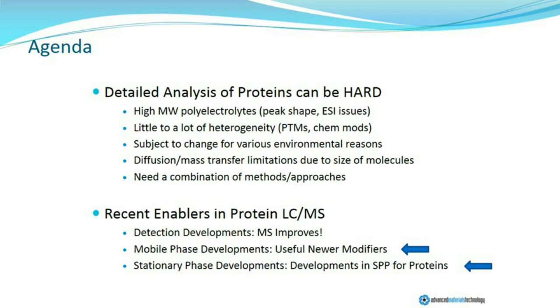Now, because of the inherent complexity of the analytes that we're interested in, I do not want to give you the impression that there is a singular technique or technical approach to resolve the analytical challenges for protein or peptide analyses. So we're generally talking about a combination of methods and approaches. Today's discussion will largely focus on reverse phase methods, but please have an appreciation that this is not the only thing that I believe to be important.